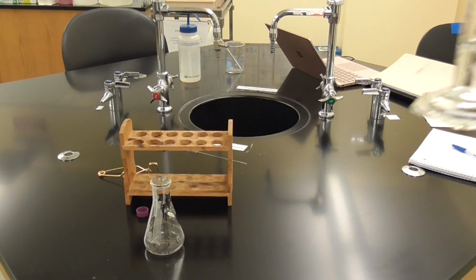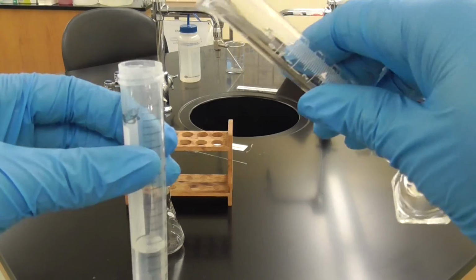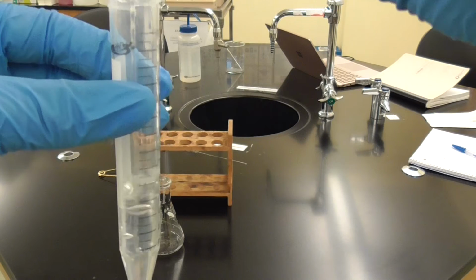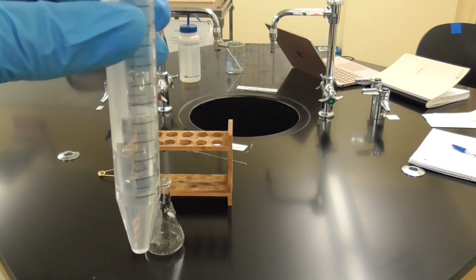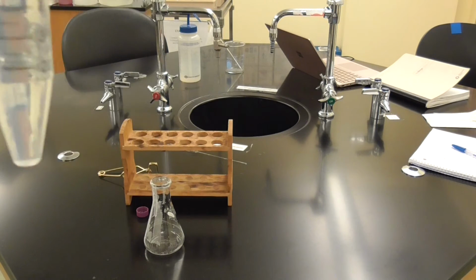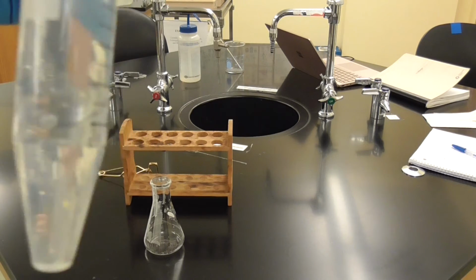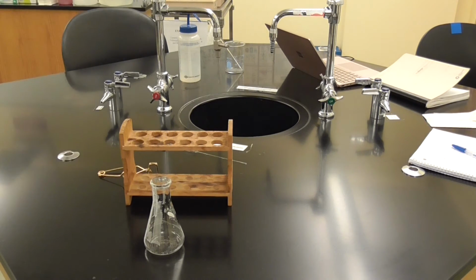So this is the second round of the methylene chloride. And they're forming the two layers again. So we're going to put it on the vortex. You can actually see a part of it, because what I did is I added some of the salt.